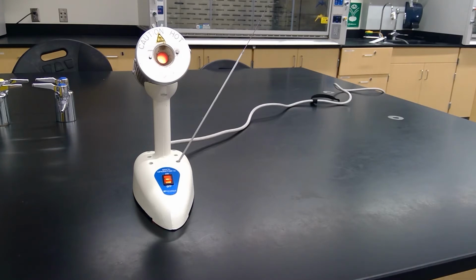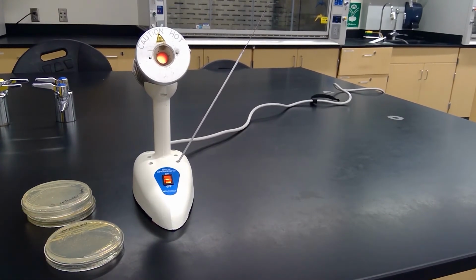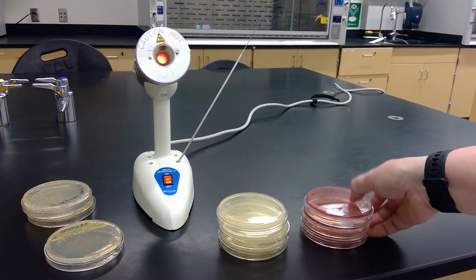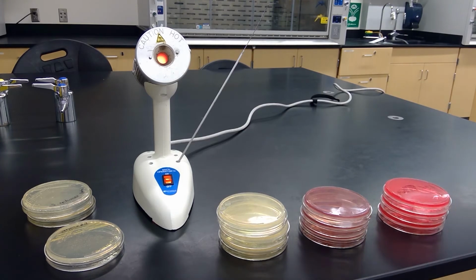So I'll gather the materials that we need. So these are our controls. And then this is our unknown. And then I'll grab 3 of each, the MSA, PEA, and MAC plates. So this is the PEA, this is the MAC, and then this is the MSA.